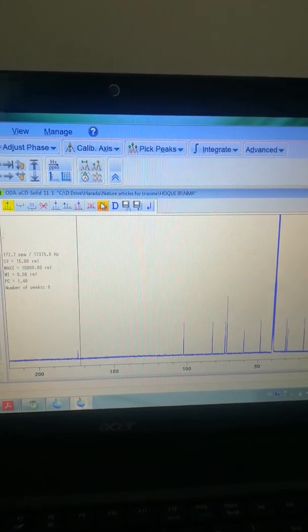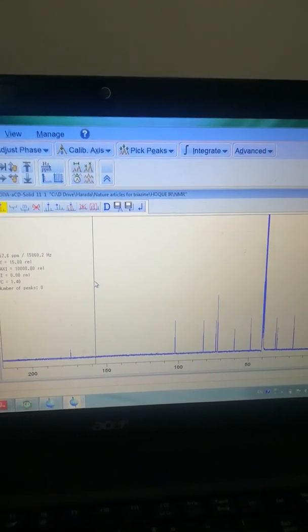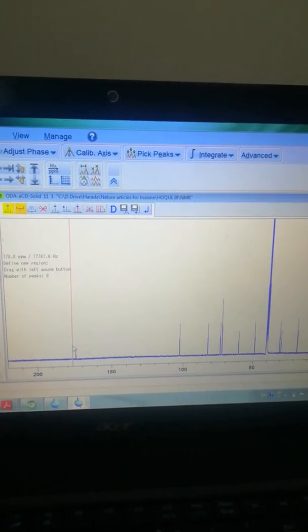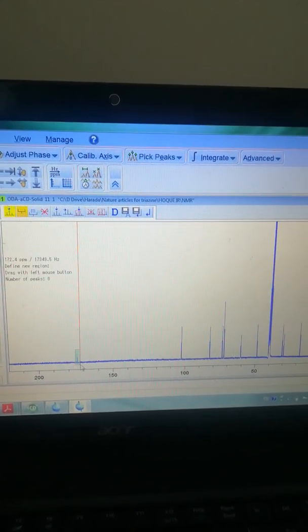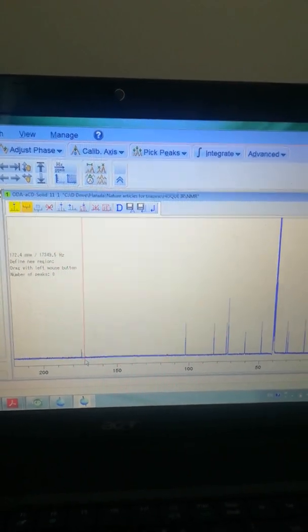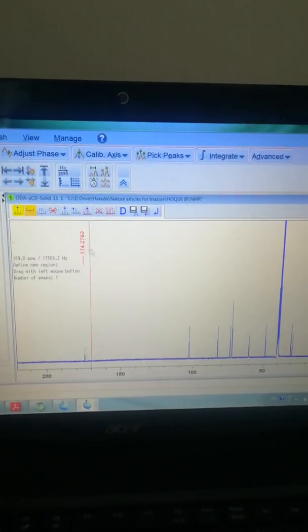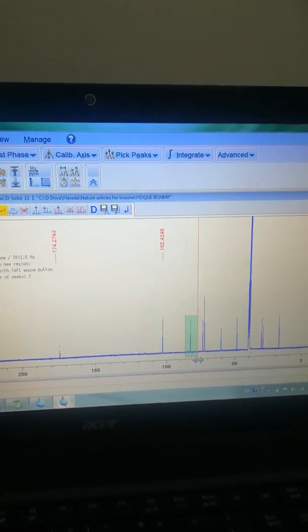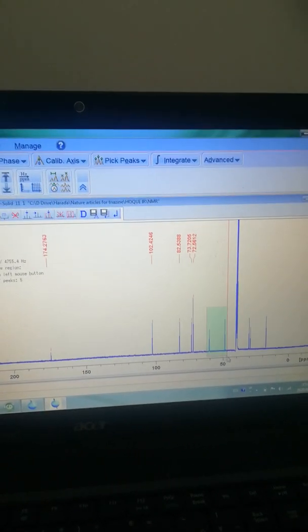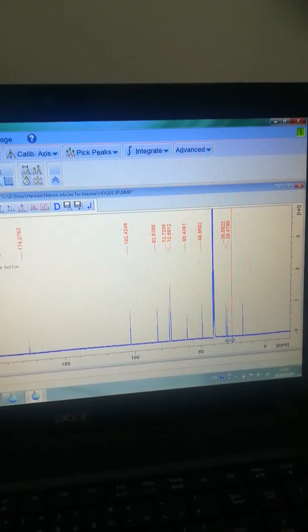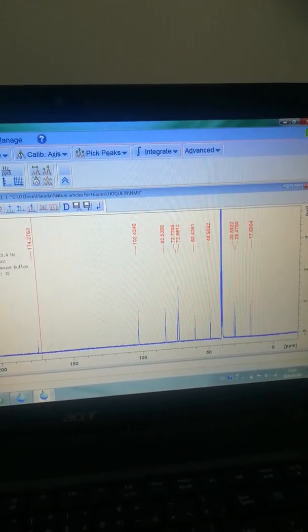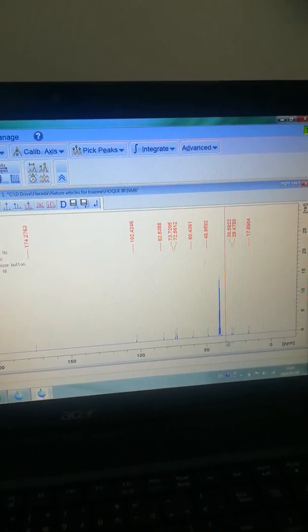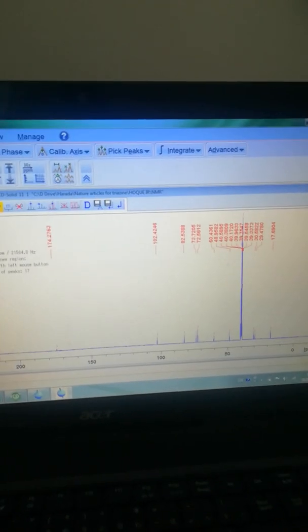First I deleted all the peak picking. Now if I want to include peaks manually, just click here and define the region using your mouse. Now the peak picking is appeared. In the same way you can do it here, and also here, everywhere you can do peak picking. The DMSO peak around here you can also define in the same way. Now my spectrum is almost ready with all peaks defined.